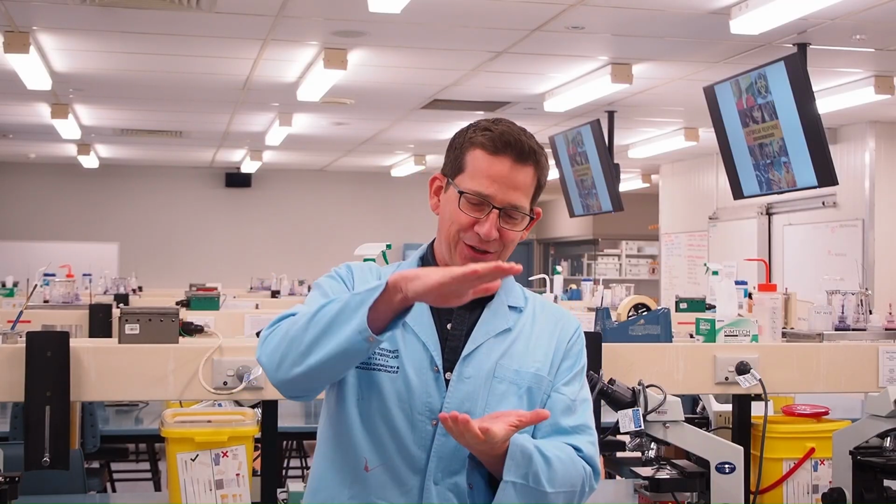And at the end of the last session, what we had done was simply take our PAGE gel with all of our proteins resolved vertically, and then taken the gel and horizontally transferred our proteins onto a nitrocellulose membrane. It's that membrane that we're going to take today and finish off the Western blot. It's to the membrane that we will start to add our antibody solutions. In that way, we will detect or not whether there are immunogenic proteins within our purified collection.